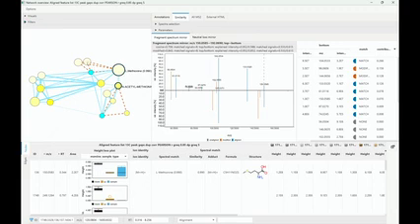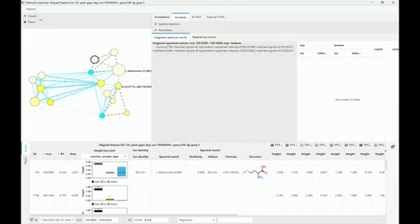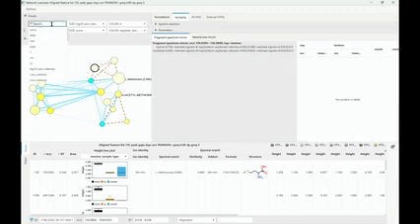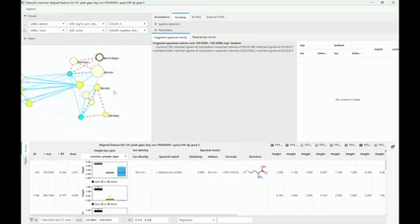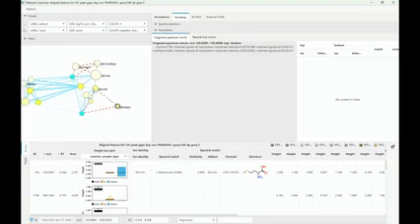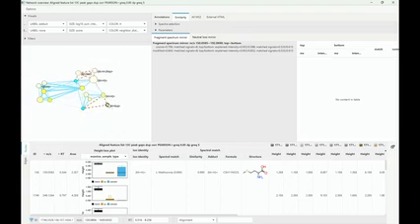And I just want to stress here, everything you can change. You can go for the label and say, I want to see the adduct. So you're going to see that there's the M plus H, M plus sodium, and M plus 2 sodium, which makes sense if we have a lot of oxygen groups, maybe coordinating these adducts. And the other one only had an M plus H and M plus sodium. So you can always change the colors, the edges. We can use DREAMS from Roman. We can use any other method.